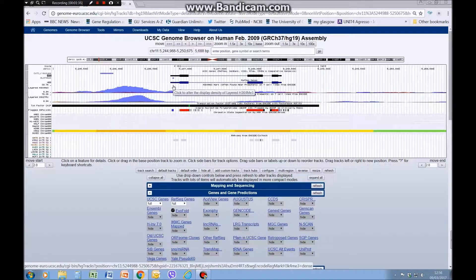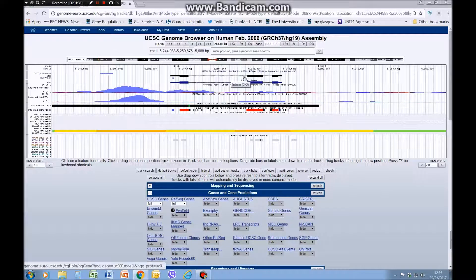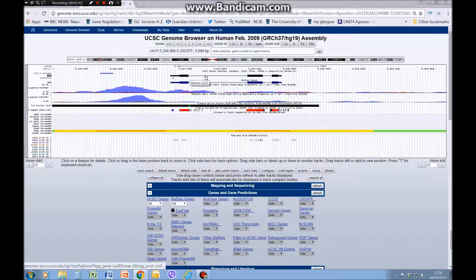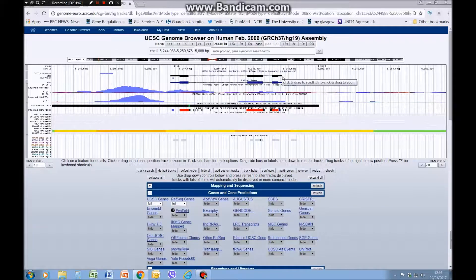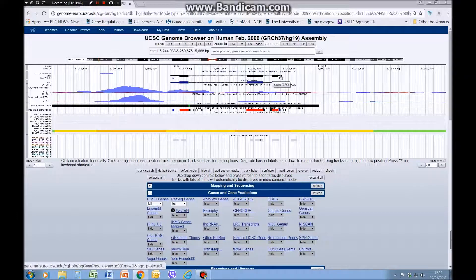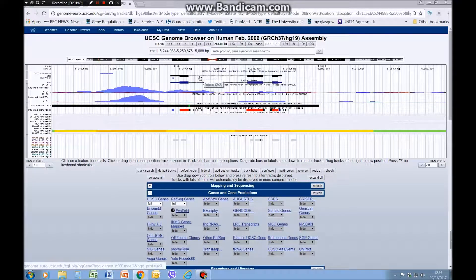To understand how these genes are represented: the little arrows pointing from right to left indicate that the direction of transcription is from right to left. The thick bars are exons, this section is the untranslated region, and these are introns.